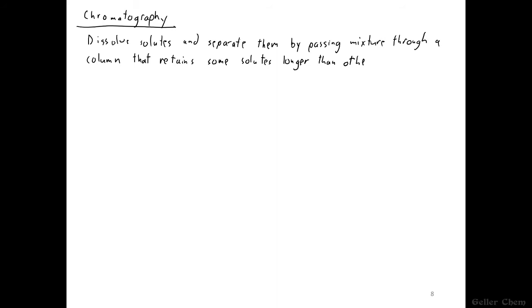In the previous visual slide, we saw that the red chemicals were slower than the green because they were being retained by the column longer. Now let's just draw a couple of snapshots of the chromatography process. So let's draw a crude column represented by this rectangle. And at the very top, we're going to draw two chemicals.